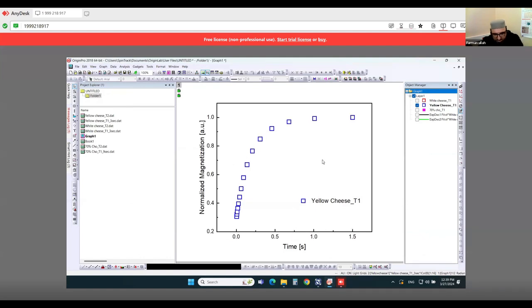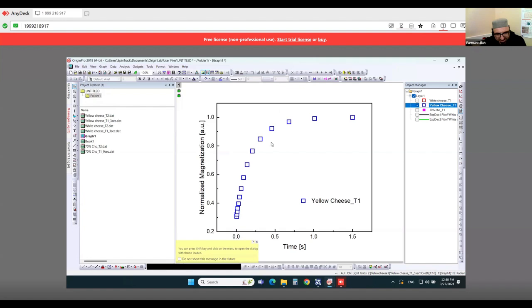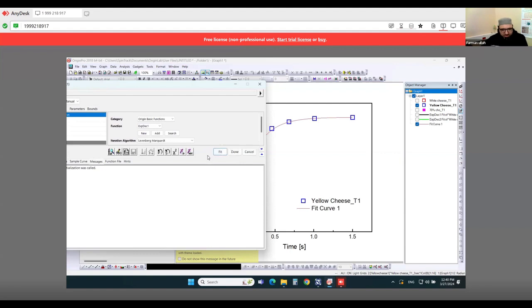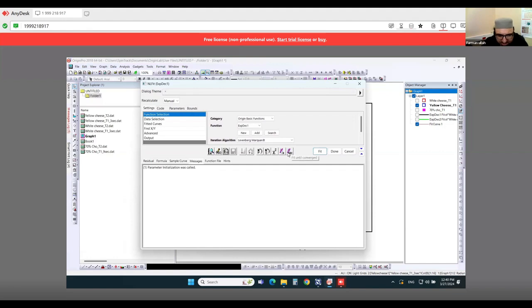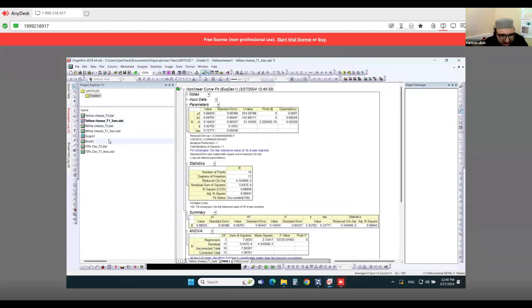Okay, and I will rearrange this, because we have to give some 15 minutes to questions also, so I am going to just apply the fitting. In Origin you can use some shortcuts, how much depends upon your experience. With practice you can save your time.